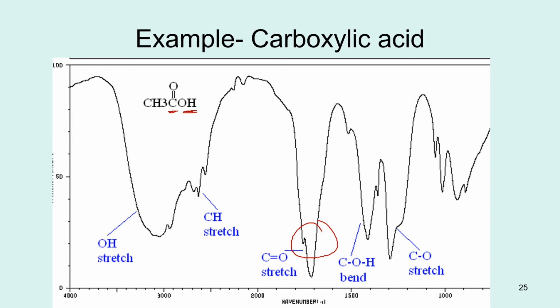And then you have this big sort of fat tongue here, and it kind of looks almost like a beard where it's shaggy throughout the whole thing. And that will often happen when you have hydrogen bonding. So that's partly why the OH stretch is so fat, because of hydrogen bonding. But if you've got the O here, hydrogen bonding to a hydrogen, and then the HO over here on the next carbon, it's kind of holding them, so it's keeping the vibrations a little tighter than they would normally be, and so it's making that a little bit more jaggedy.